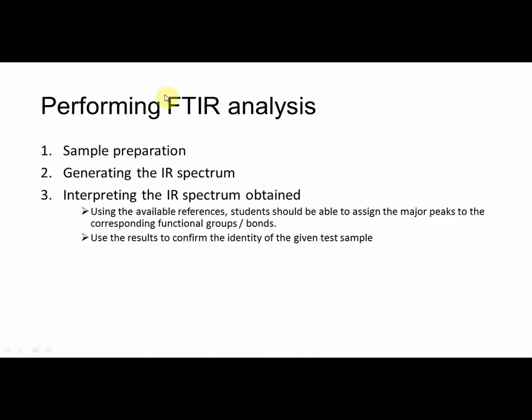FTIR analysis involves the following steps. Firstly, sample preparation, followed by the introduction of the sample into the FTIR instrument and generating the IR spectrum. And lastly, interpreting the IR spectrum obtained from the analysis.